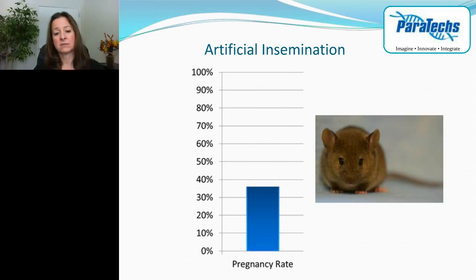And the pregnancy rate that we then saw from that was 36%. I believe that we can actually improve upon this. We're working with the protocol right now to make it happen, but it was a very promising initial result.